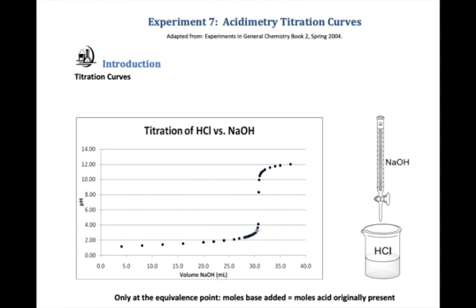Then much smaller amounts of sodium hydroxide will give a much larger change in the pH, and the place where we're looking for an endpoint, that is an indication that our reaction is complete, is where the pH changes most rapidly, the steepest place. Professor Tatko will walk you through that again in a little more detail with the software.